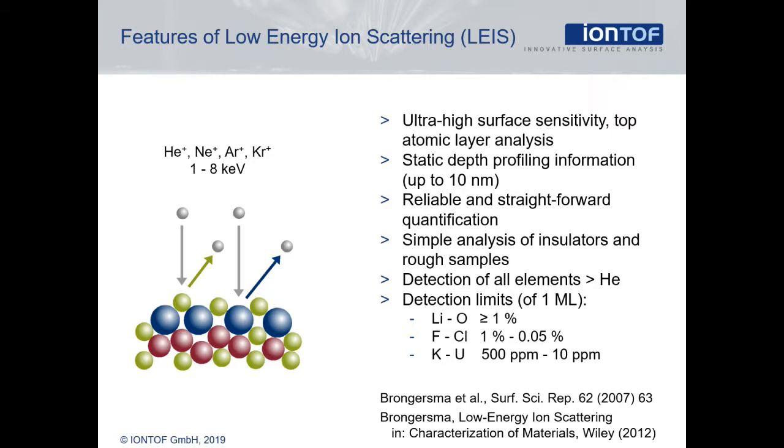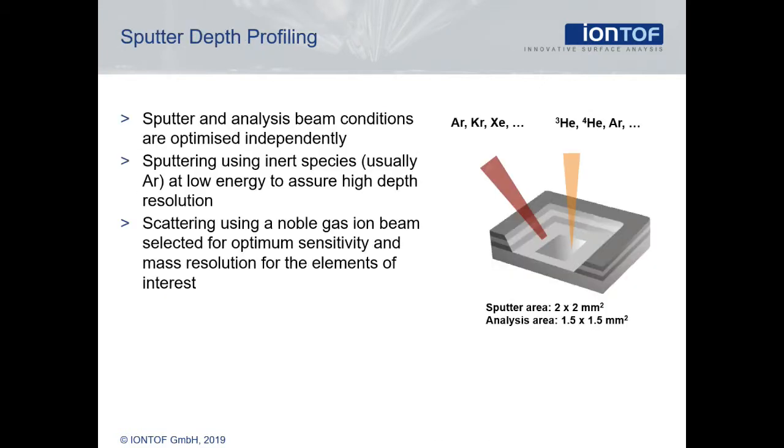Sometimes the depth range of this information is not sufficient, or an element is not present at the surface and therefore cannot be identified from just the in-depth information. It is important to note that light elements do not show the in-depth information at all. In these cases, classical sputter profiling can be applied.